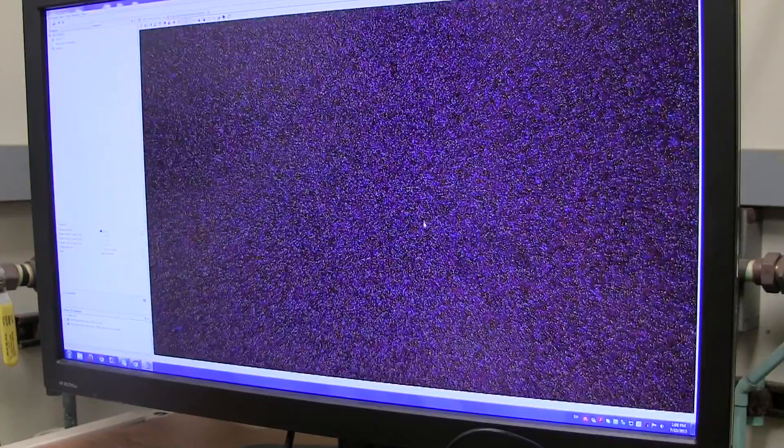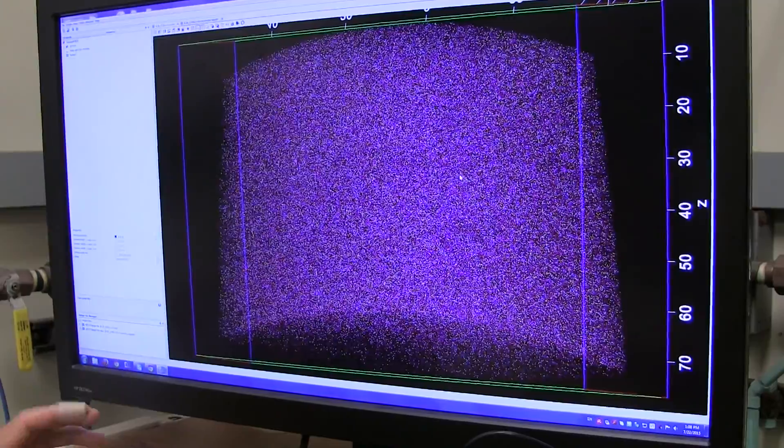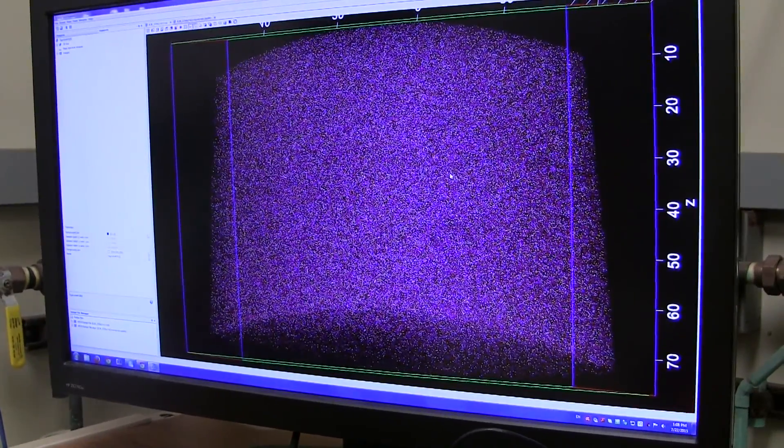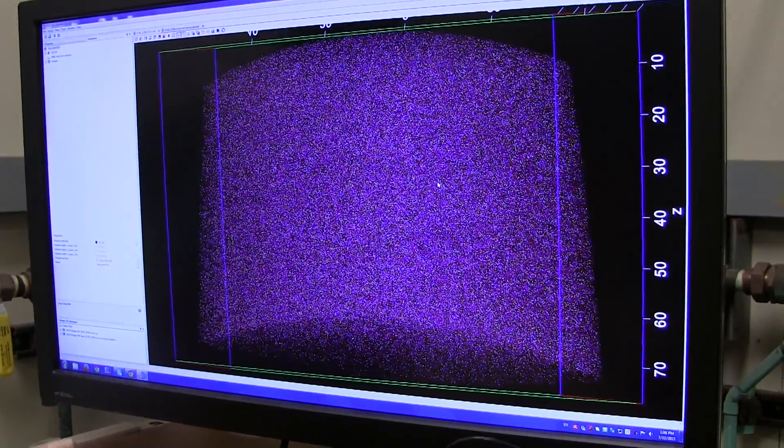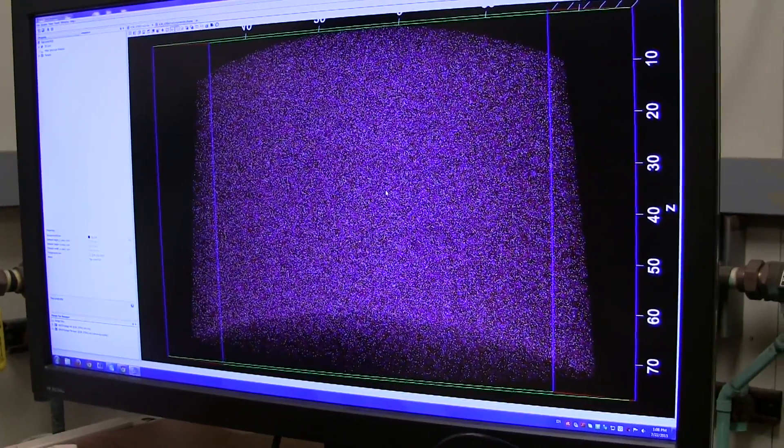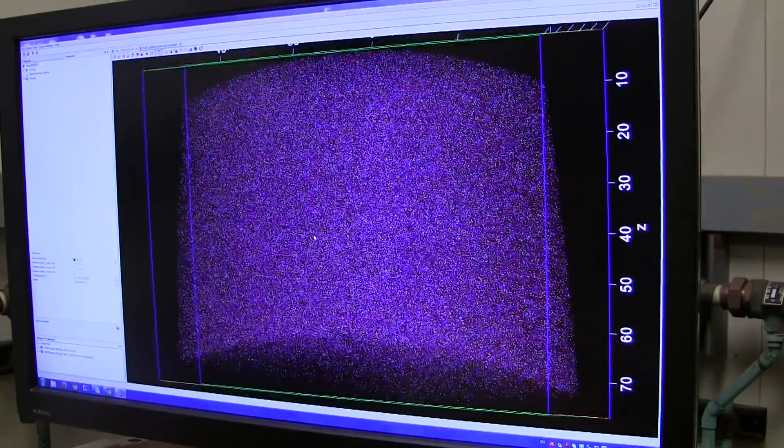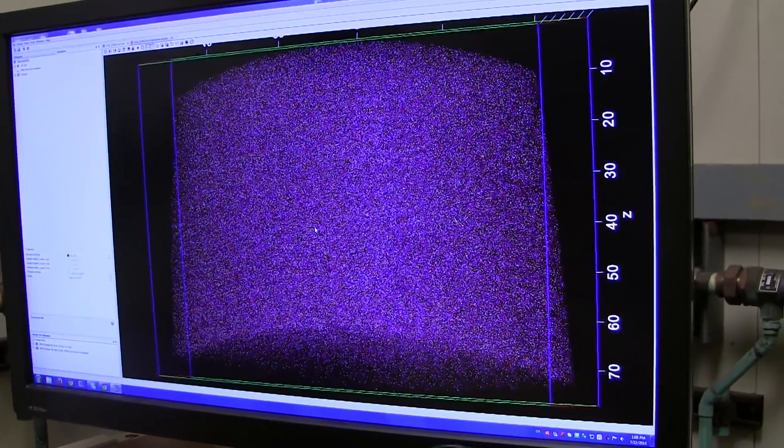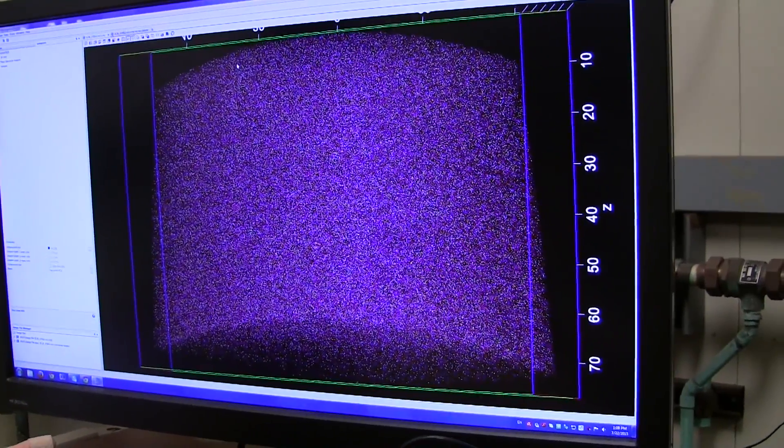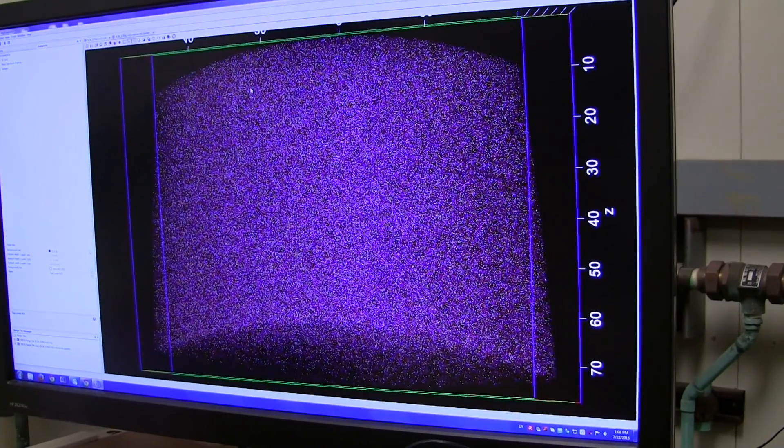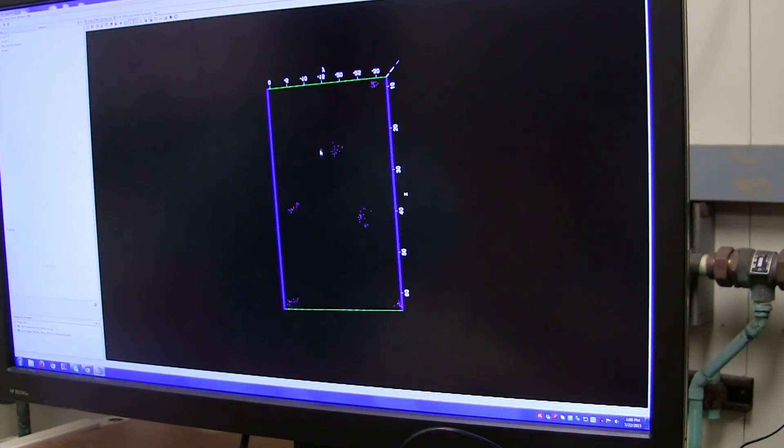Now what you're seeing is not actually the atom itself, but the computer model of the atom given the amount of time it flew from the tip to the detector, and the mass to charge ratio of each specific atom. What we're specifically looking for in this particular project is clusters within the sample. And so here, we have our cluster information.